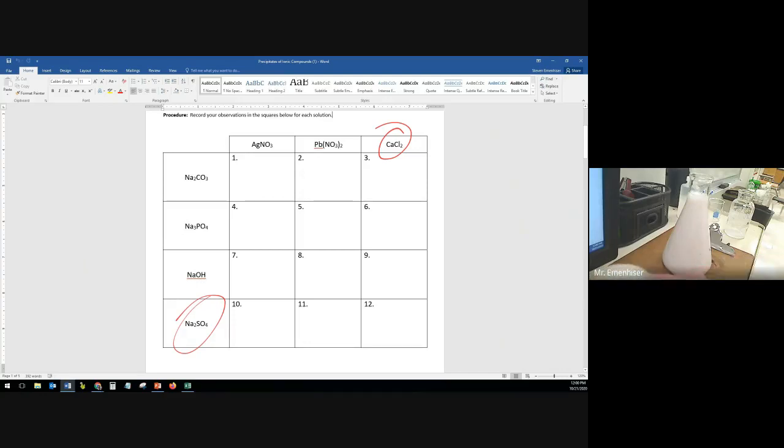Okay, now I'm getting full. So let's move some of this nice stuff to another beaker. And now I'm going to have 2 beakers with colorful stuff. Let me see what else I got back here. Something interesting.